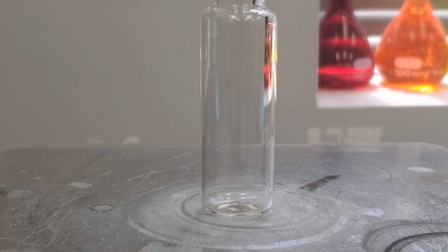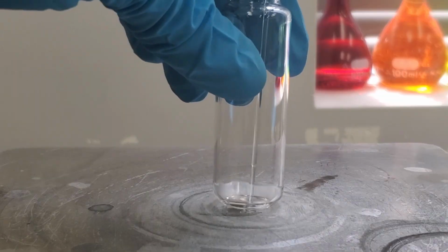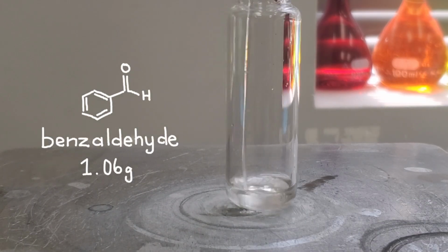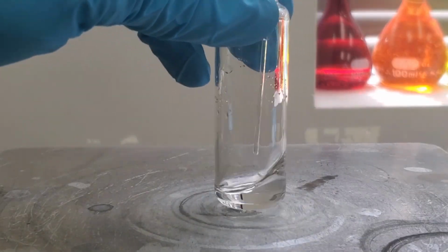Today, I'm going to show the synthesis of dibenzylideneacetone by aldol condensation, starting with about 290 milligrams of acetone and 1.06 grams of benzaldehyde in a vial. Then I mixed the solution thoroughly so the two reagents were fully combined.